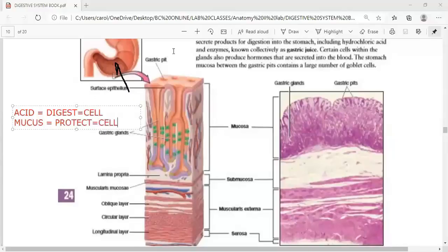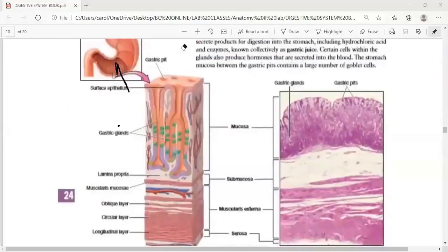As you can understand in here, in the stomach, you must have at least 2 different types of cells, right? One that produces the acid and the other one that produces the mucus that protects the stomach. That's why you can see here that they are showing different colors, to show you that you're going to have, obviously, different cells that are going to perform different functions. So in our stomach, we not only need the acid and the mucus, we are also going to need other substances, but these substances are going to be produced by the cells that you have right here in these gastric glands. The cells that you're going to have in there are going to be parietal cells, mucus cells, enteroendocrine cells.